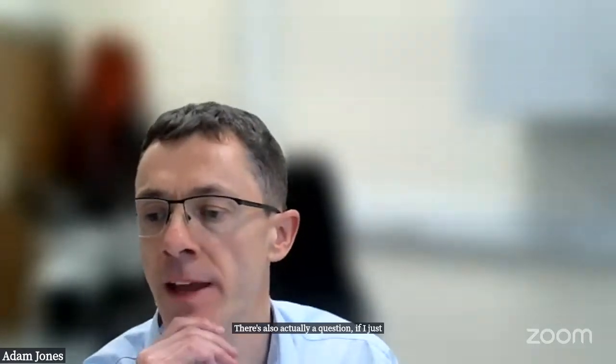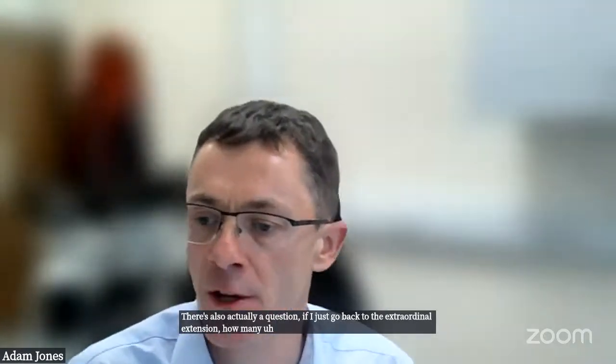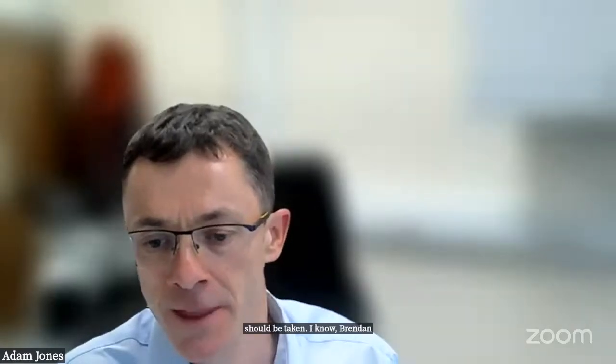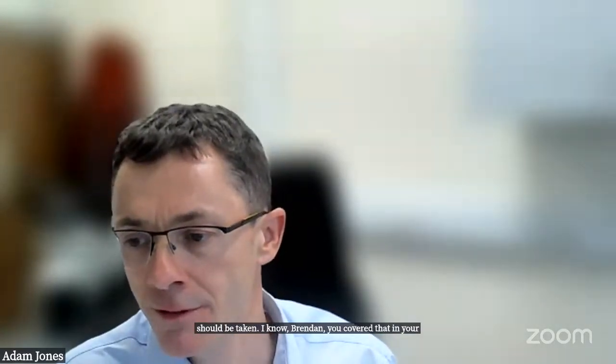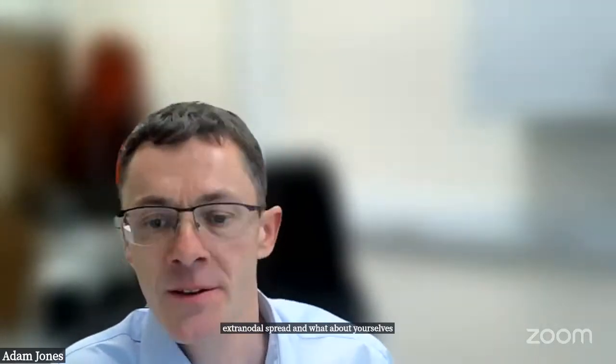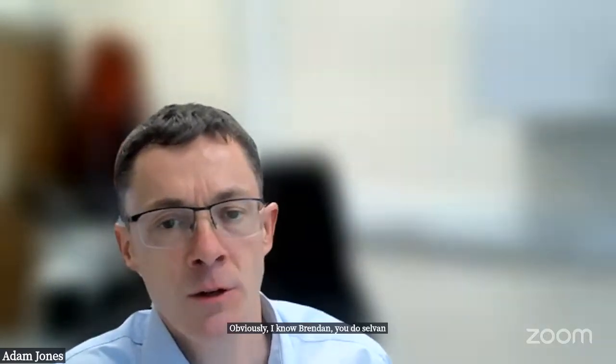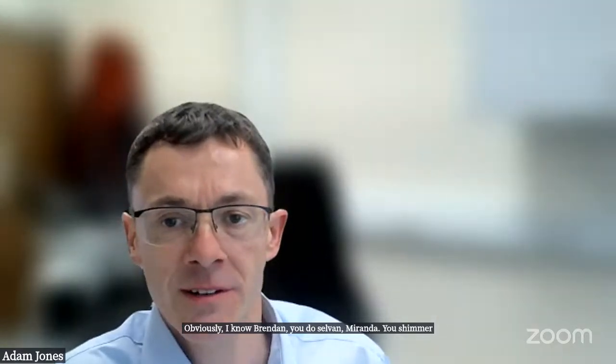There's also actually a question, if I just go back to the extranodal extension, how many blocks should be taken? I know, Brendan, you covered that in your talk. For me, I do generally just take a few blocks if there's macroscopically obvious extranodal spread. And what about yourselves? Obviously, I know, Brendan, you do. Selvin, Miranda, are you similar, or do you block the whole node out?